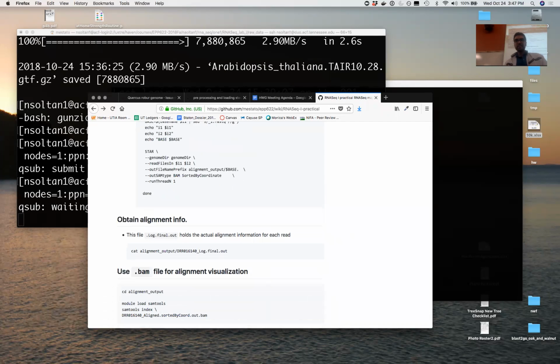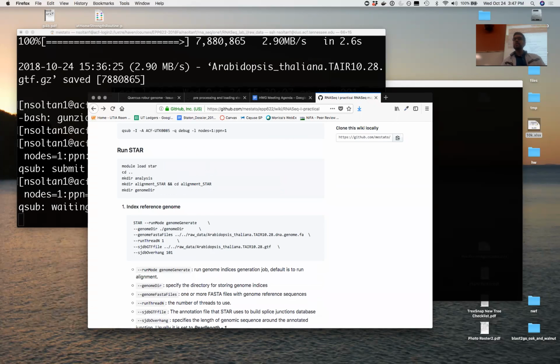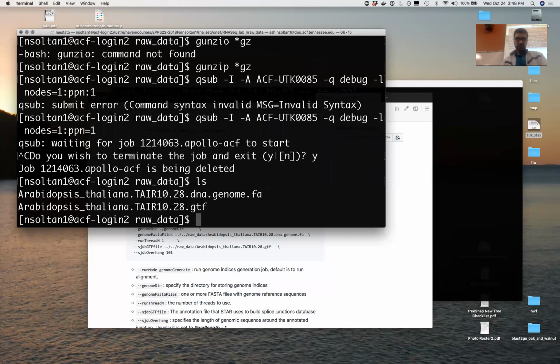And here we need it. If you want to do it on the head node, and everybody whose job isn't launched, don't run on the head node. If your job is launched, go for it. But if it hasn't, maybe just don't do it. Once it launches, we can go back and go through some of this. But normally, if you just want to, sure, we'll see that keeps up and move on. But it doesn't look very promising. Okay.